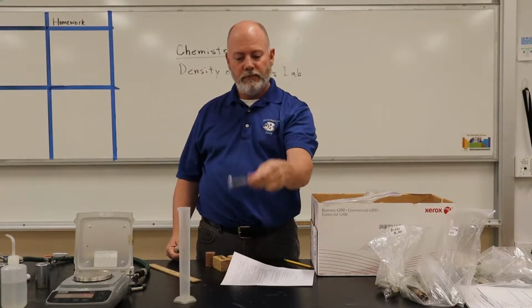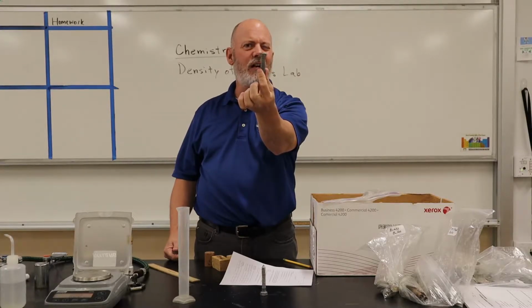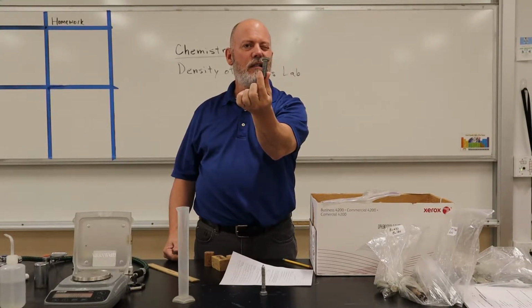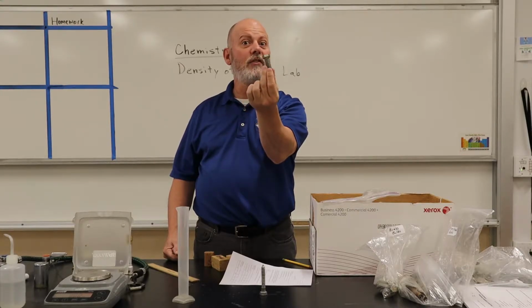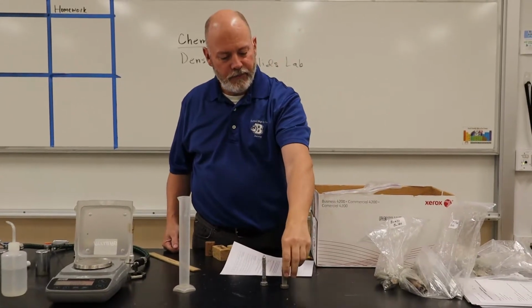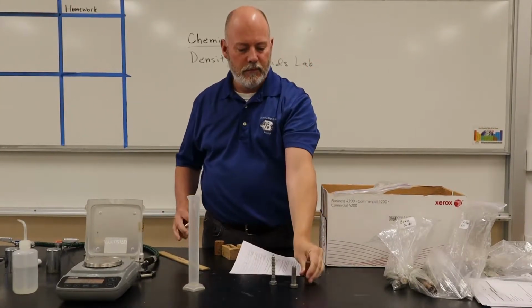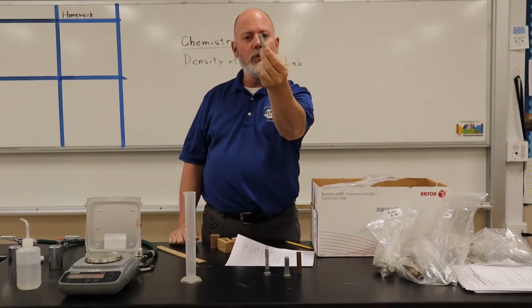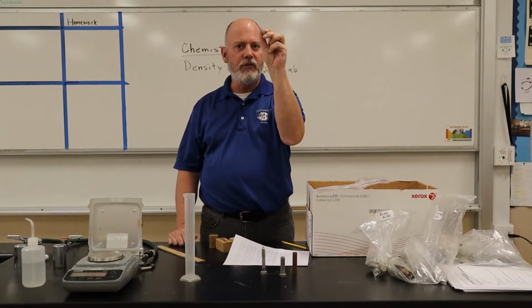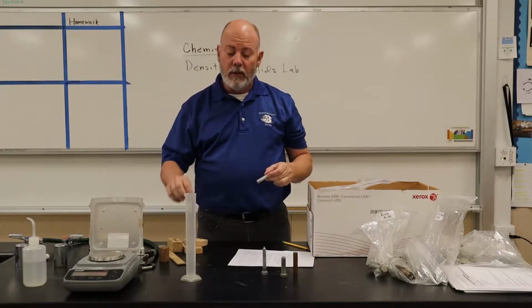We have iron, we have brass, which is a combination. Mr. Iwan, brass is copper and zinc? Copper and... I think it's copper and zinc. Yeah. Bronze is copper and tin, right? So brass is copper and zinc. So this is an alloy. And then we have just solid copper, and we have a piece of solid aluminum, right? These cool aluminum cylinders. All right, so let's just do the metals. And then we have 4 different woods. We'll get into that in a minute.